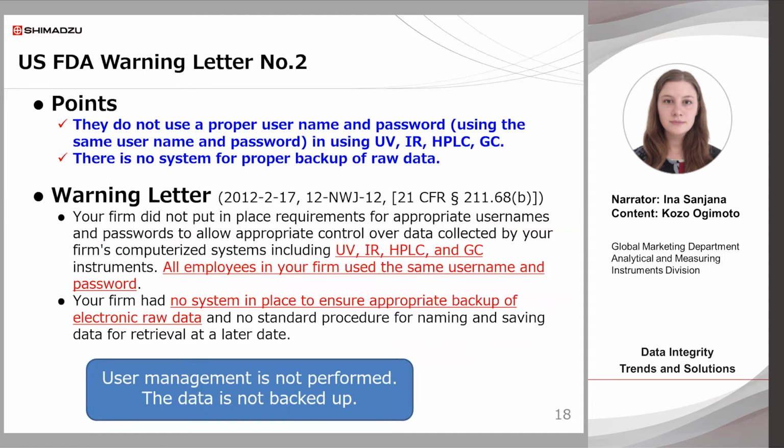Here is the second example. Firstly, it was pointed out that all employees use the same username and password to access the UV, IR, HPLC, and GC instruments. In this case, it is not clear who logged on when and who has been using the system. There is no user management and everyone has the same permissions.